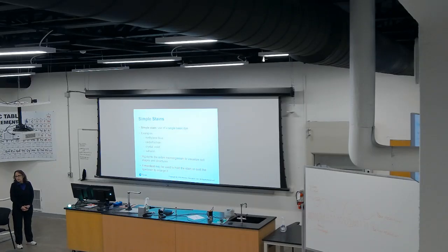I would say that any cell can pick up these type of stains, but it depends on what you will be using it for, or what is that typical protocol that it is used. So sometimes we can use methylene blue instead of crystal violet, which basically crystal violet will stain your samples purple instead of blue, but it depends on what do you want to use it for.